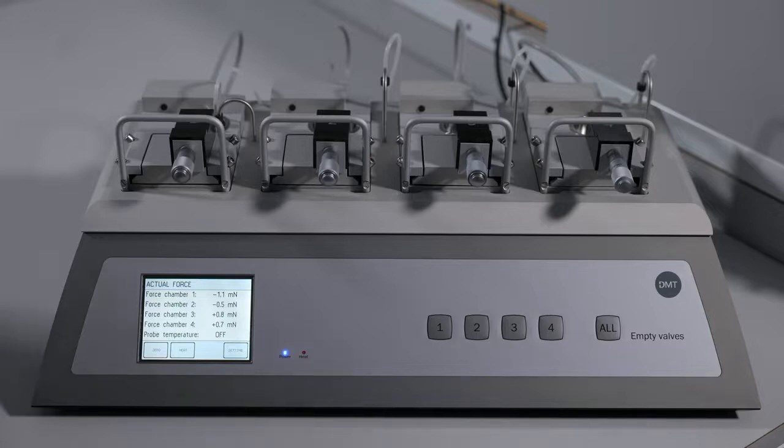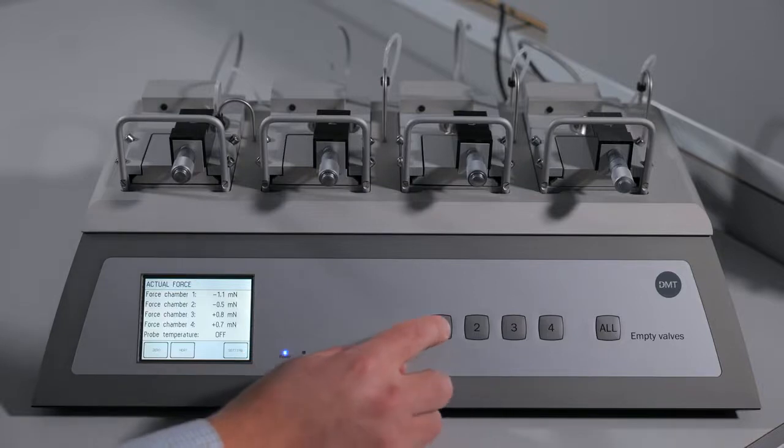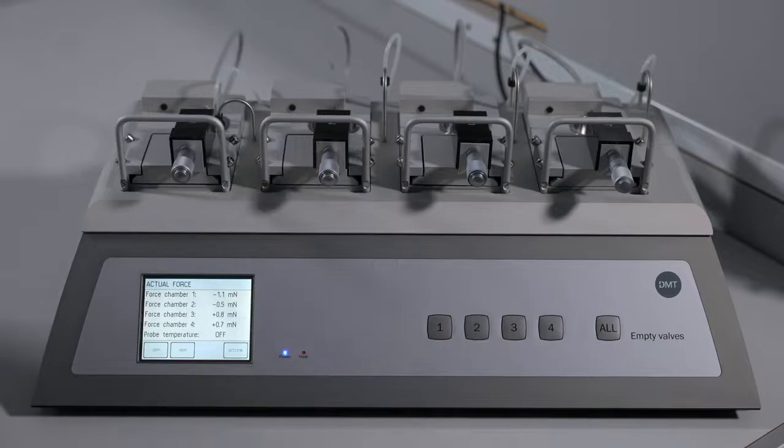Make sure your vacuum source is turned on and begin pressing the buttons. What this is doing is continuously hitting the tubing with the vacuum valve inside the myograph. Eventually, the tubing will pop open and your vacuum will return as normal. If this fixes the issue, go back into the settings menu and change your valve delay to the appropriate length of time. However, if this does not seem to work, you will proceed with the troubleshooting.